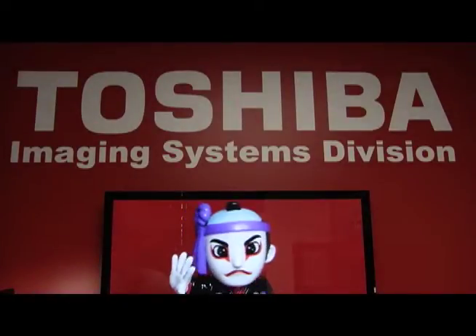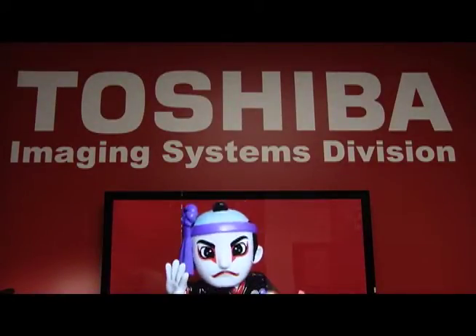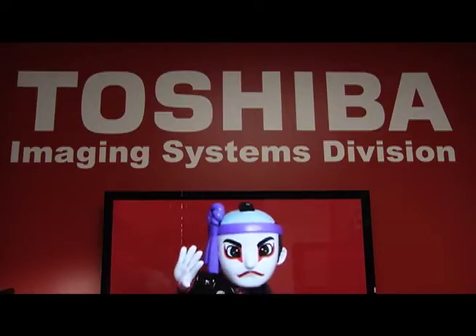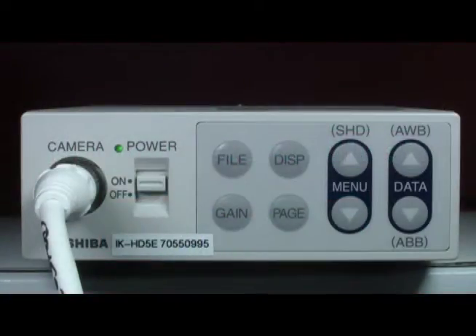This is a short video clip for performing shading on the Toshiba high-definition cameras. The shading procedure can be performed in a similar manner on all our 3-chip cameras. Here we'll use the Toshiba IK-HD5 to demonstrate.